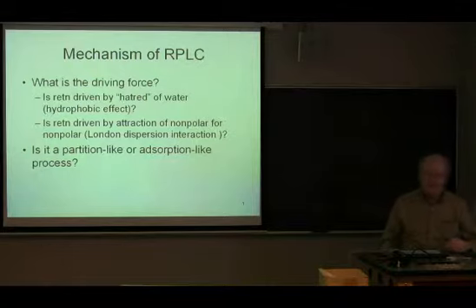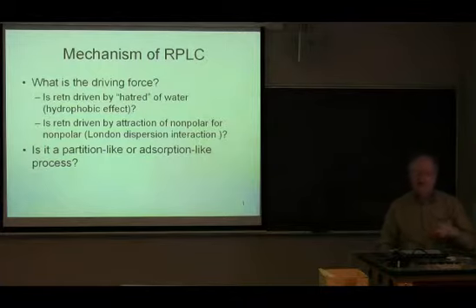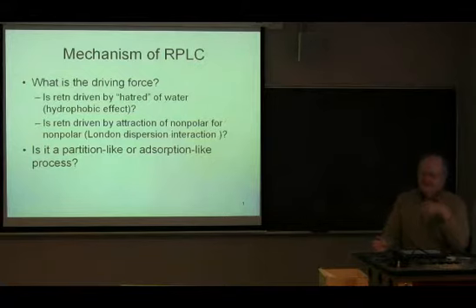The other model is the exact opposite of that, and that is that the retention is driven by the attraction of the non-polar solute for the non-polar stationary phase, which is driven by the London dispersive types of interactions. You couldn't have 2 more different theories of what's going on here.